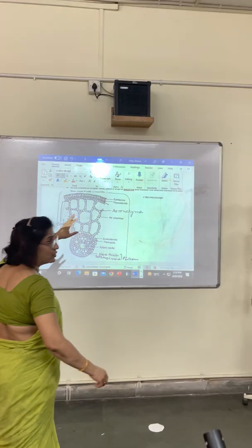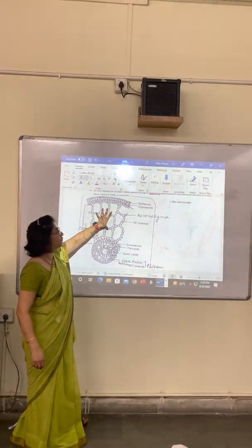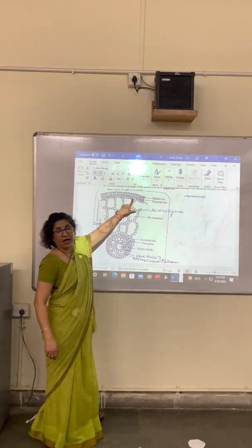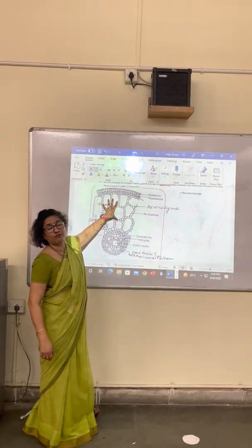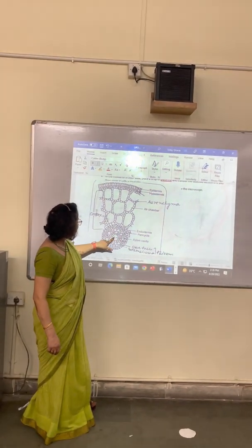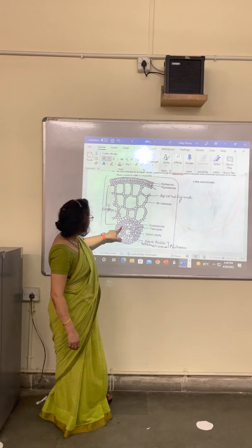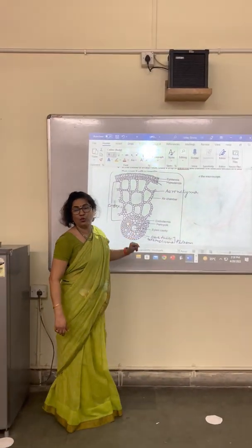Since it is a hydrophytic stem, it will have lots of air chambers — aerenchyma, which is parenchyma with lots of air spaces. The outermost covering is epidermis, under the epidermis hypodermis is there, and the cortex has lots of air chambers which give it buoyancy. Xylem is reduced to one central element because it does not need to conduct water. Phloem is very well developed, and endodermis and pericycle can be seen very well.